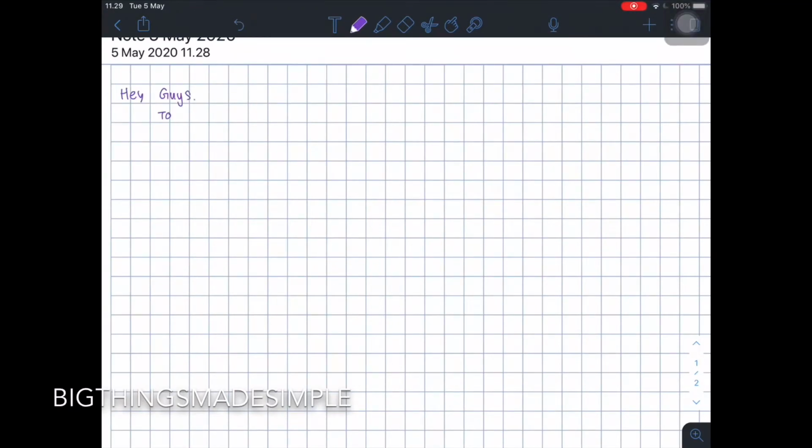In today's video, we're going to be talking about gram staining and what it is used for. So gram staining is used to classify bacteria into two groups according to the differences in the composition of their cell wall. In the outcome of gram staining, there are two outcomes: gram-positive and gram-negative.